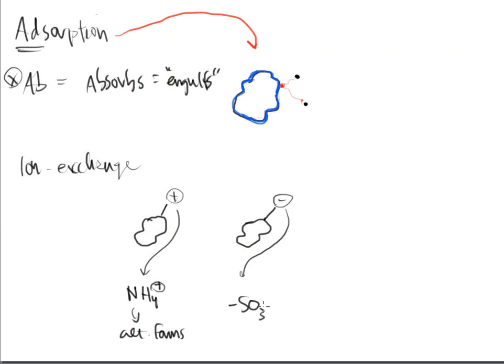Now, we'll get into more detail about how this happens when we get into the world of ion exchange and ion chromatography, but for now, I think that this does a pretty good job basically telling you how they're different. So this one's a full-blown charge that attracts the opposite charge to it, so it can help separate your components from each other. So that's ion exchange, and more about that later.